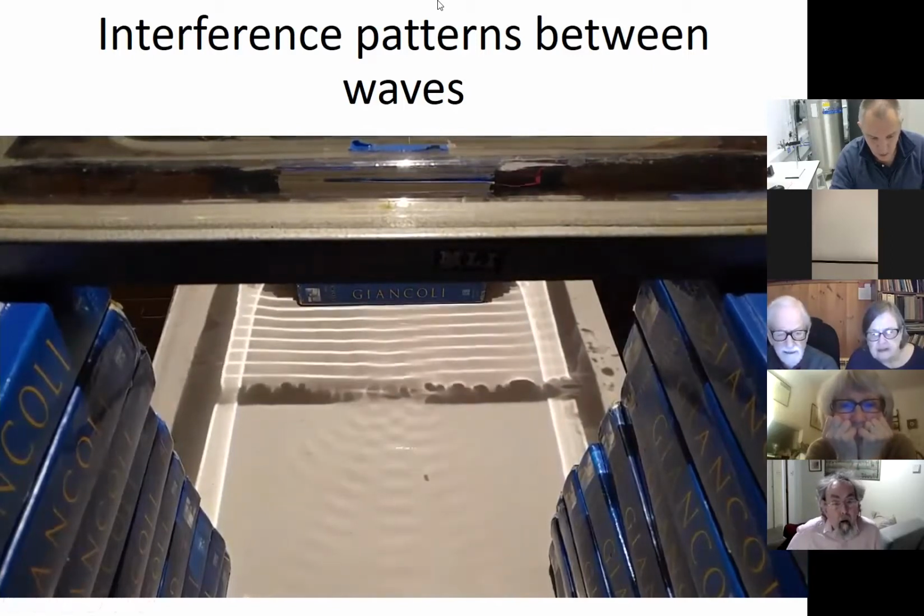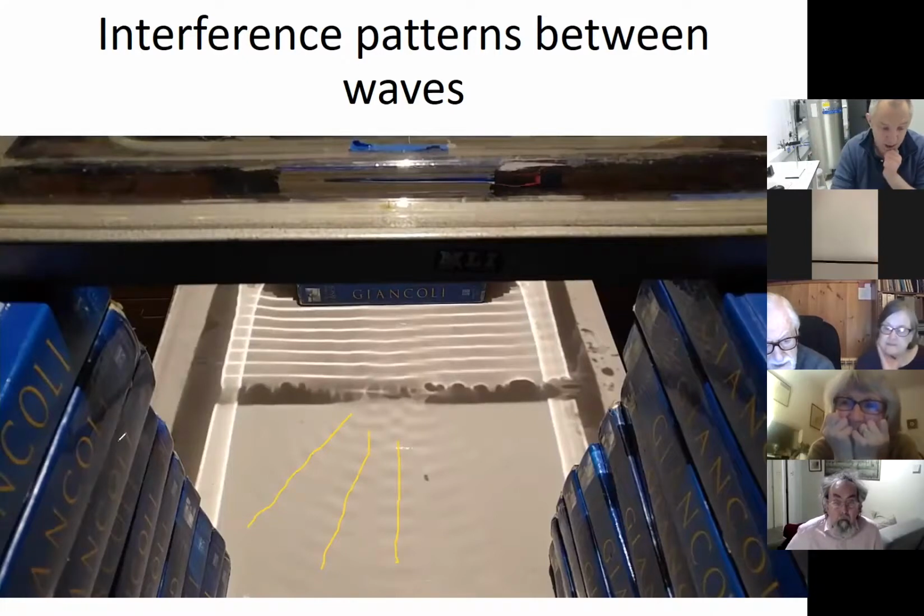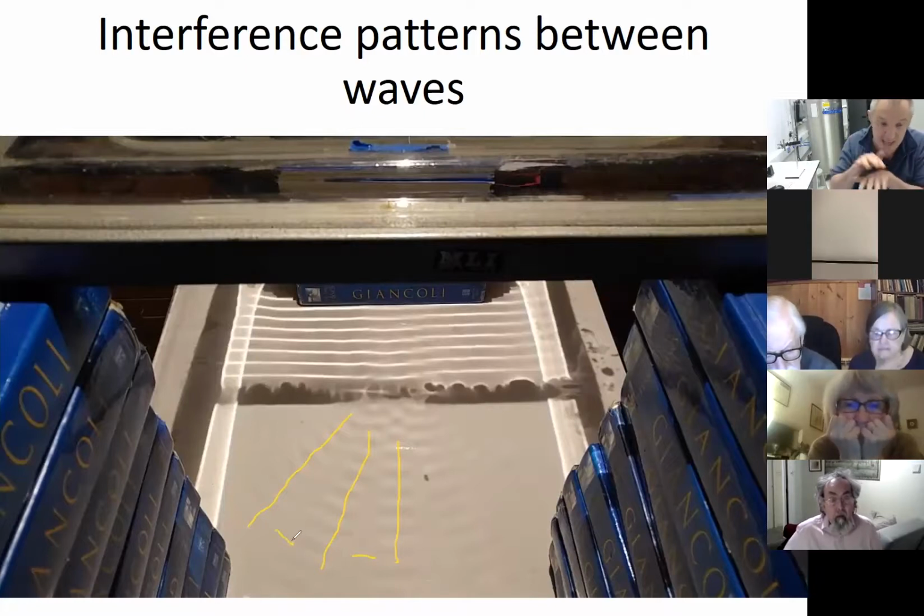You can see there are the waves and they spread out. And what I hope you can see if I annotate them is that these are the high intensity waves that come out, and they are where the waves reinforce each other and add up to something bigger. And then in between them, you see these very flat areas, and that's where the waves cancel each other out. And so you see nothing.